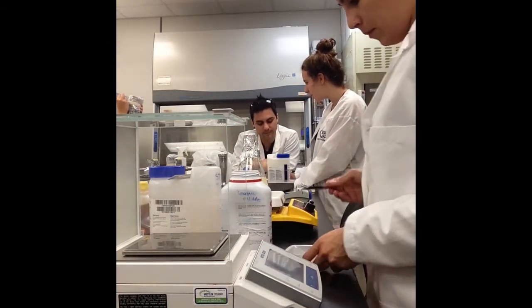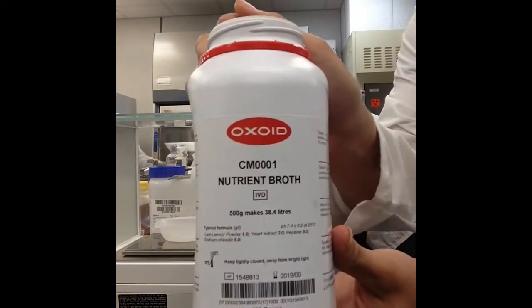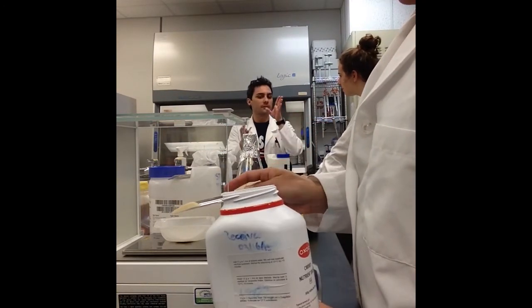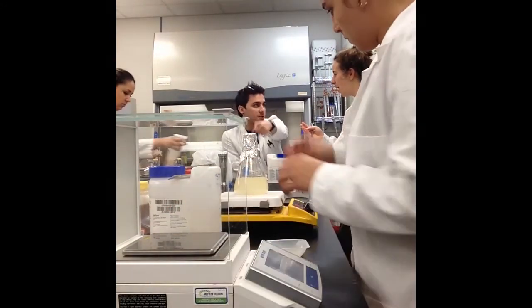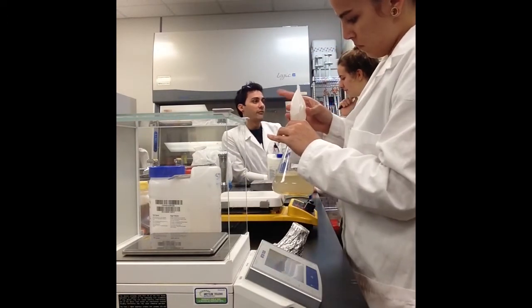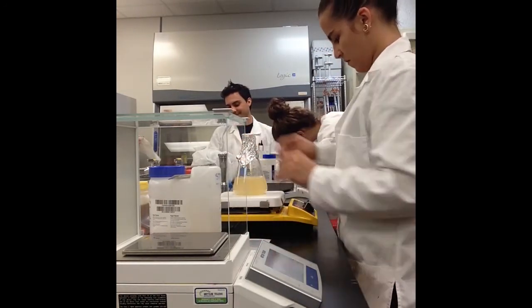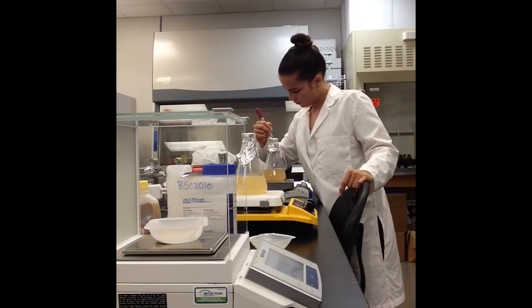During this process, my lab partners were preparing our hot plates. We laid out several hot plates at 90 degrees Celsius on the bench. In the meantime, I weighed out 3.75 grams of nutrient agar and added that to the nutrient broth and the water. We placed our Erlenmeyer flasks on the hot plates and began to stir them slowly as we measured out our honey, agave, and molasses.